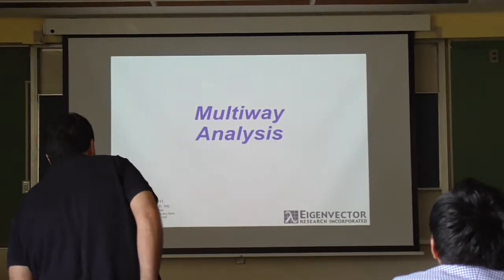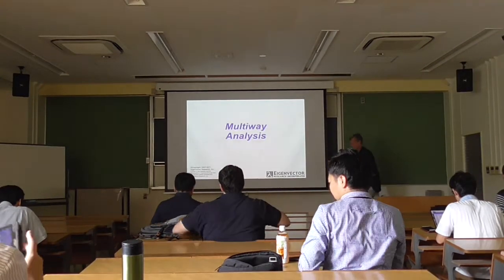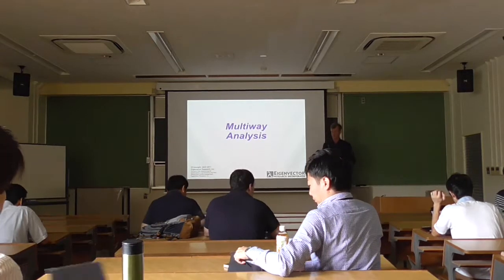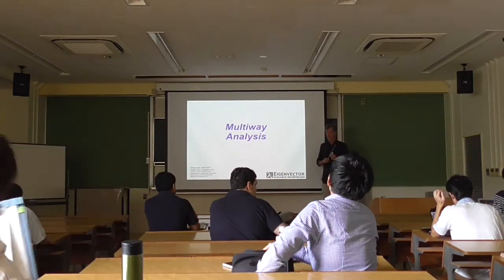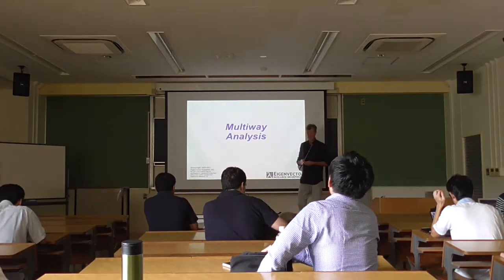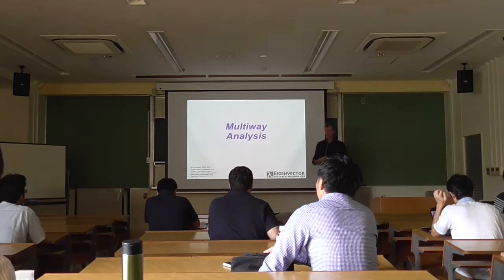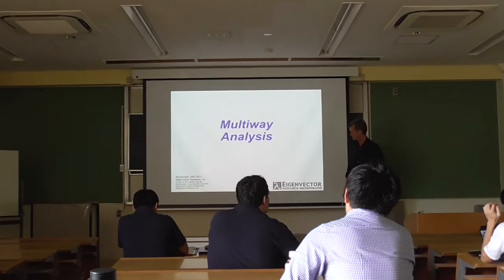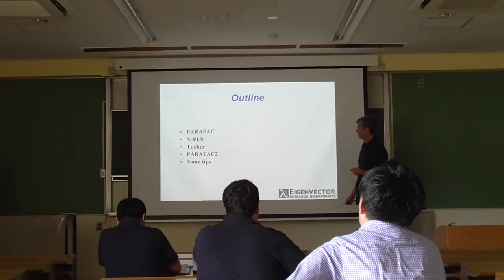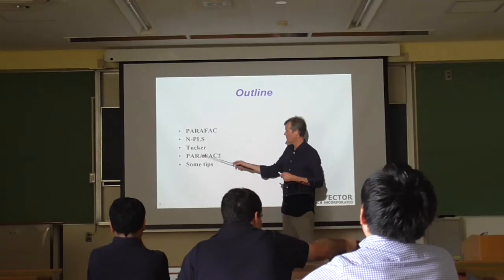Yes. So today we're going to talk about multi-way analysis, and specifically we're going to talk about Parafac. I know that some of you have worked with Parafac, but I'm going to start with the beginning, to explain all the details and also show a little bit about how we work with it in practice in MATLAB. Now, I'm actually also going to mention some other methods.